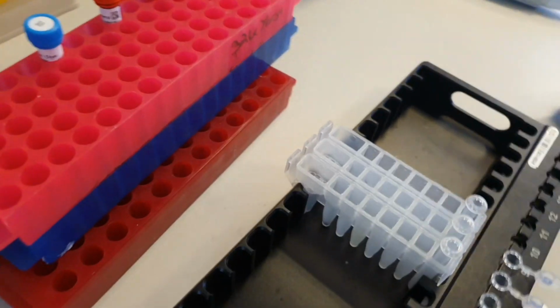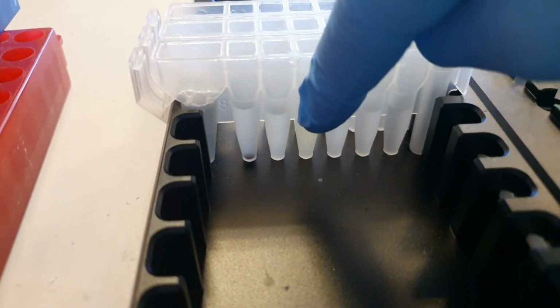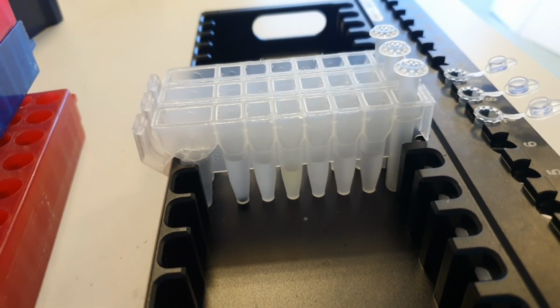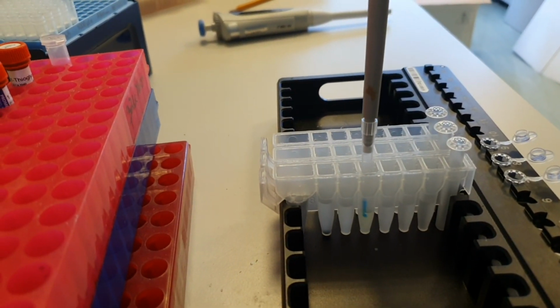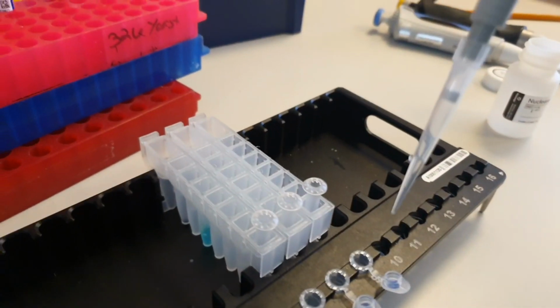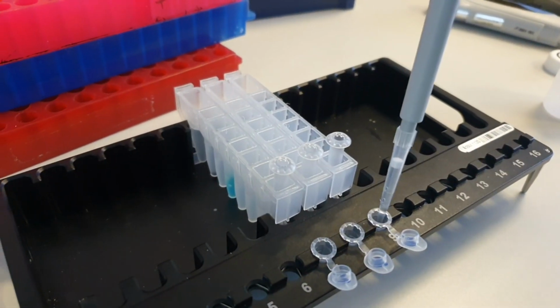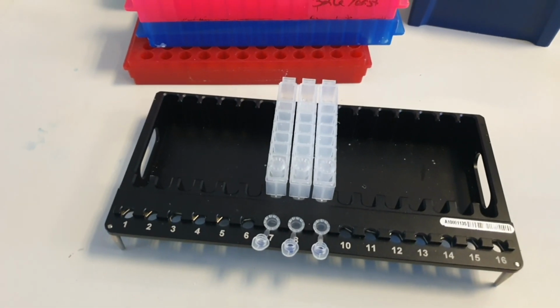The next step is to add the DNase in well number four, which is 1, 2, 3, 4. So it's this one. You can see it's with the yellow solution, so you can't miss it. We add 5 microliter of DNase solution in each well number four. One last thing we have to do is add 50 microliter of water in each of these collection tubes, and do not close these tubes. So the cartridges are completely ready now.